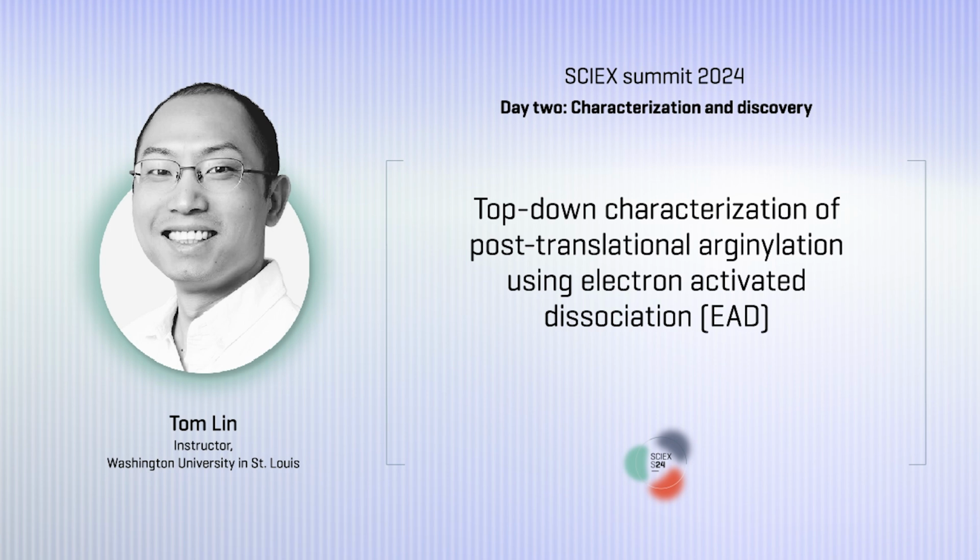Today's presentation, you're going to learn about the top-down proteomics workflow for the characterization and quantification of the calreticulin arginylation. And we're going to hear about the MS1 profile, MS2 fragmentation, where that was characterized with the EAD fragmentation.